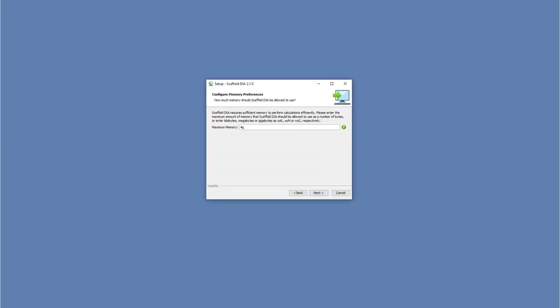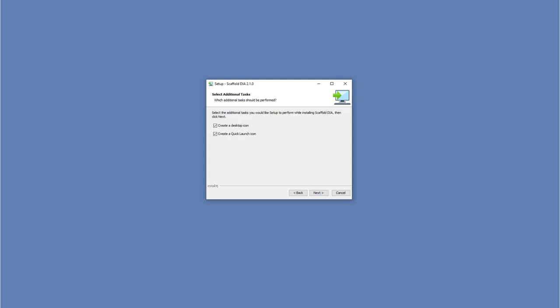Enter the amount of RAM you would like to allocate to Scaffold DIA for processing. We recommend allocating roughly 80% of your system's total RAM.